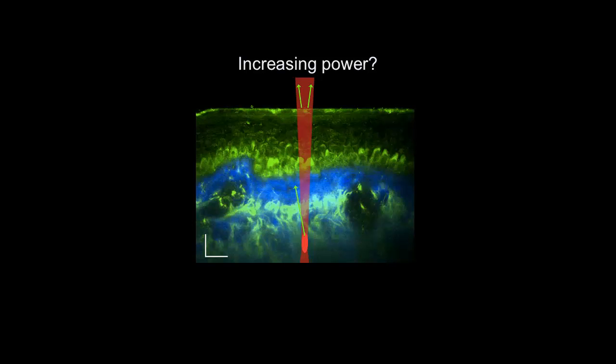So Mihaela, if I look at this image, and I'm making interpretations in my mind which I want to know whether are correct. If I look closely, in the bottom 20 microns, you start to see a blurring or a loss of resolution. You see a dimming, but these fine fibrillar features are not only dim, but they're blurred, at least in my mind. And so that seems perhaps to be due to the fact that you are losing the spatial confinement of your beam. Perhaps.